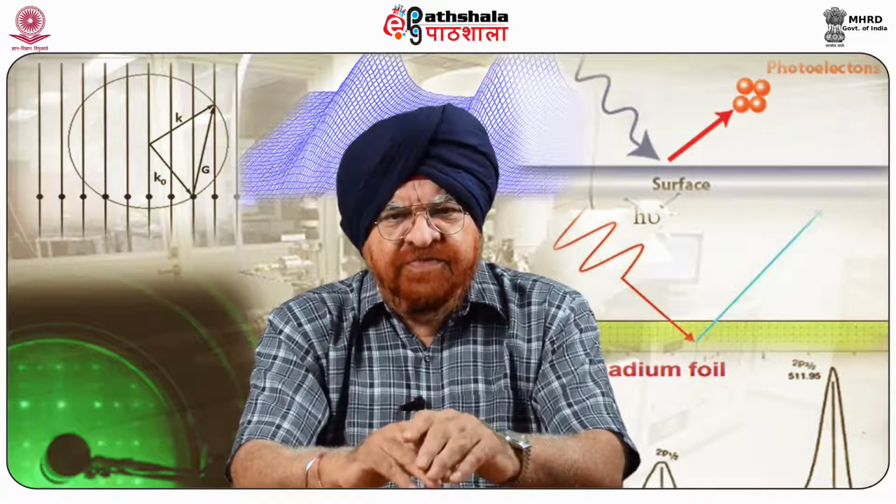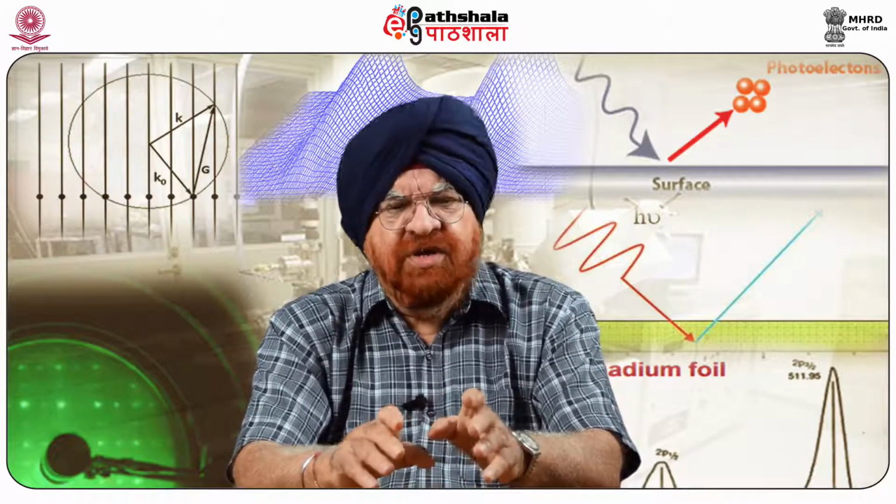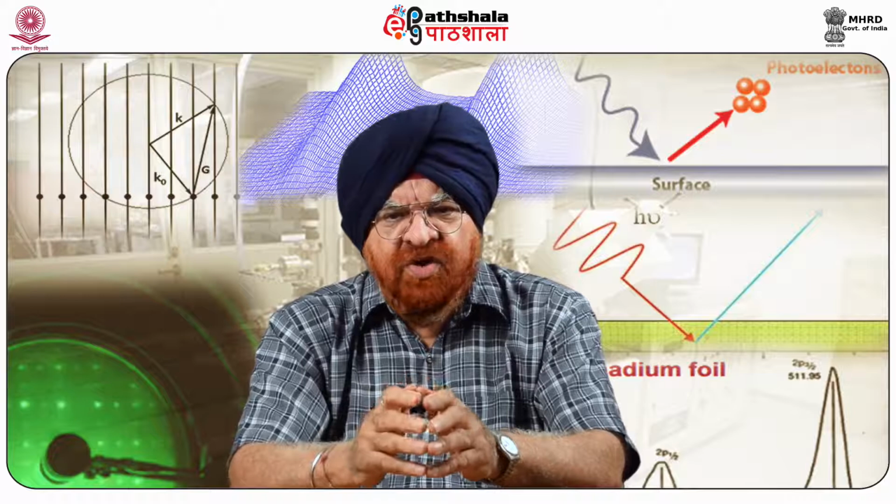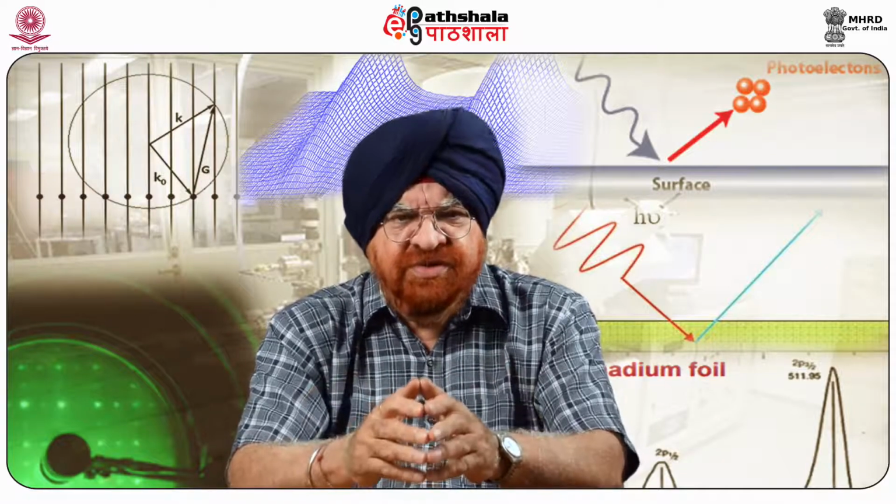Applications of the STM for imaging biological materials directly have been hampered by the poor electron conductivity of most biological samples.